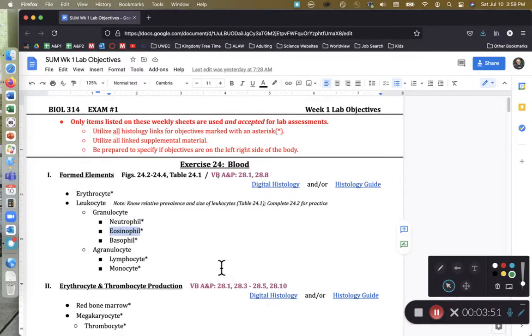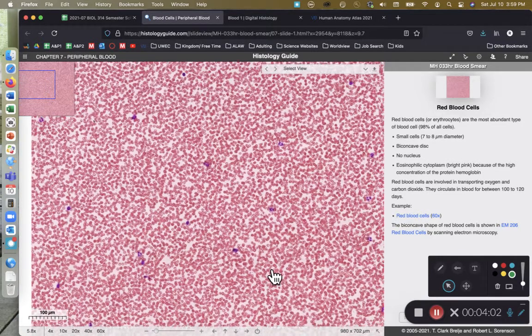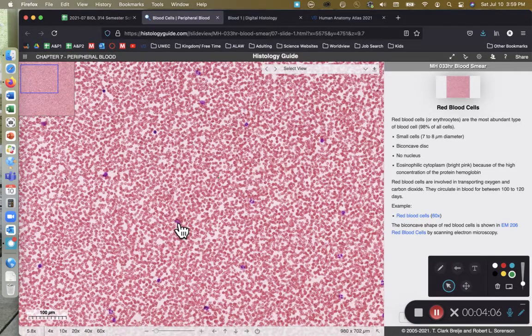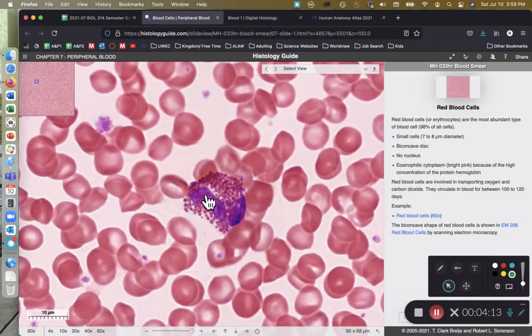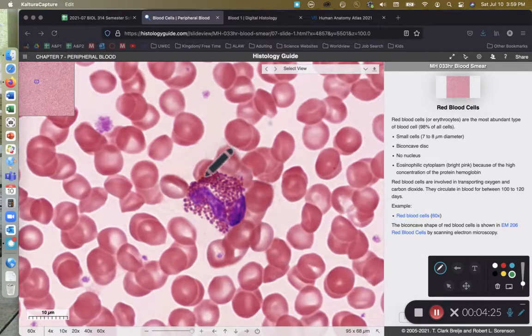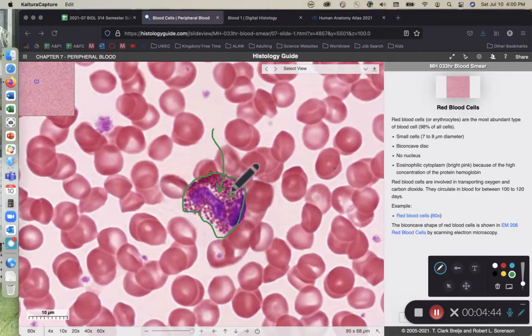Our next granulocyte is the eosinophil, and this one's a little bit harder to find. I'm scanning and looking for something that's bright pink. Right here we can see a nucleus — a multi-lobed nucleus — so we know it's a leukocyte, and we have pink granules. This cell is known as an eosinophil. It's named eosinophil because of the eosin dye used to stain the granules within it. Because these leukocytes absorb eosin, we call them eosinophils. The diameter of an eosinophil is approximately double the diameter of a comparable erythrocyte.